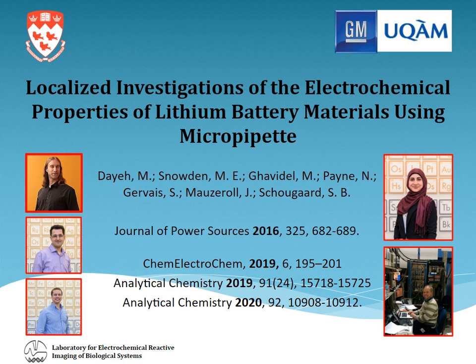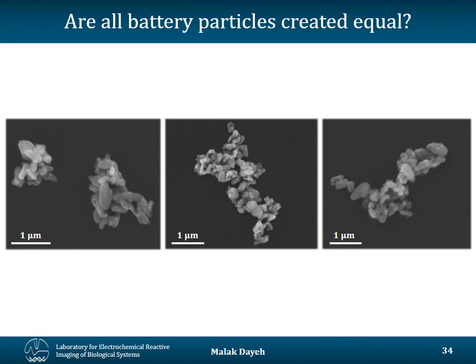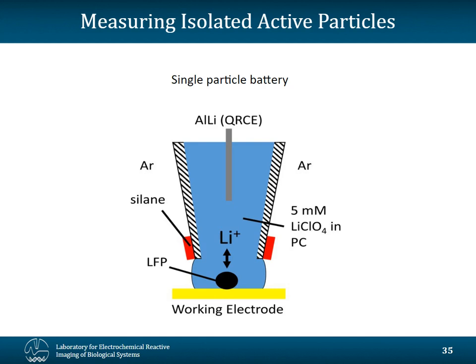There are many ways by which SECM can be used to study energy materials. You can apply it to entire cathode or anode films. You can evaluate the effect of film porosity using SECM. But you can also answer questions like, are all battery particles created equal? And that's because of the high resolution capabilities of the method.